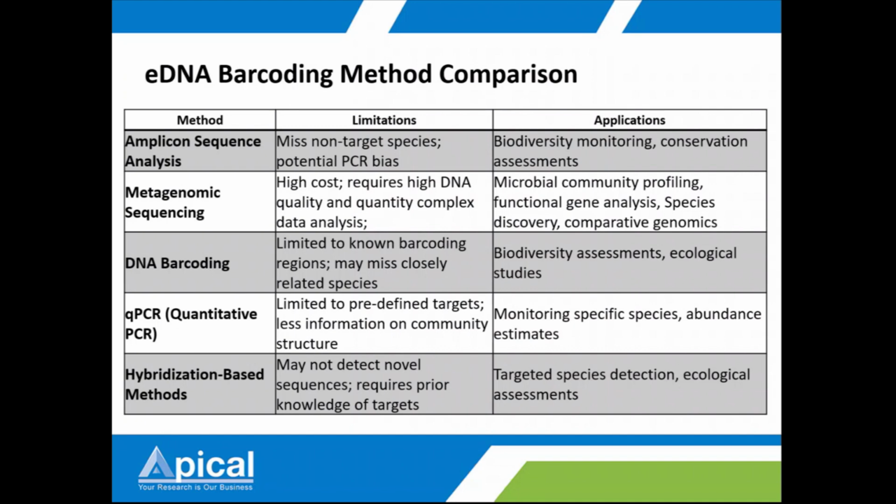For metagenomic sequencing, the cost of running it is relatively quite high because you need to have very deep coverage of sequencing data, and not to mention running the analysis, you also need computational power. So that comes with a cost.